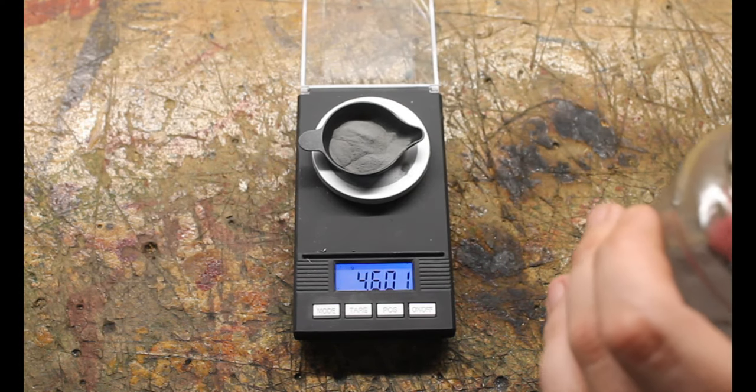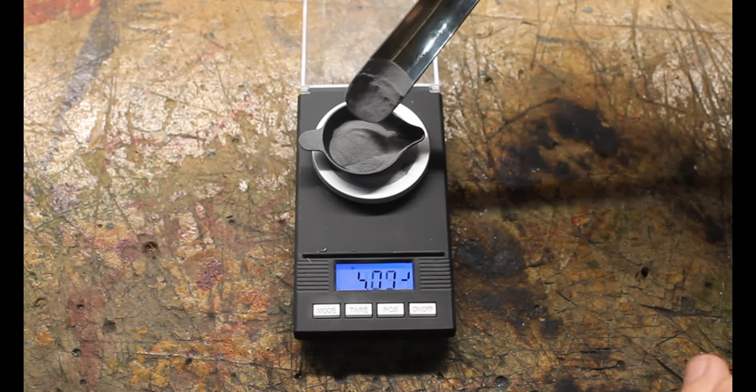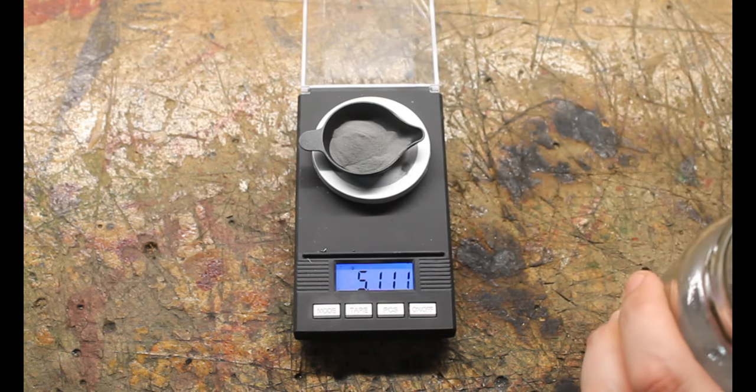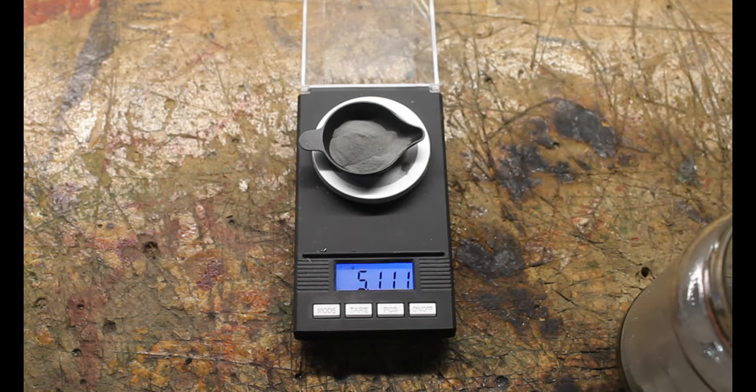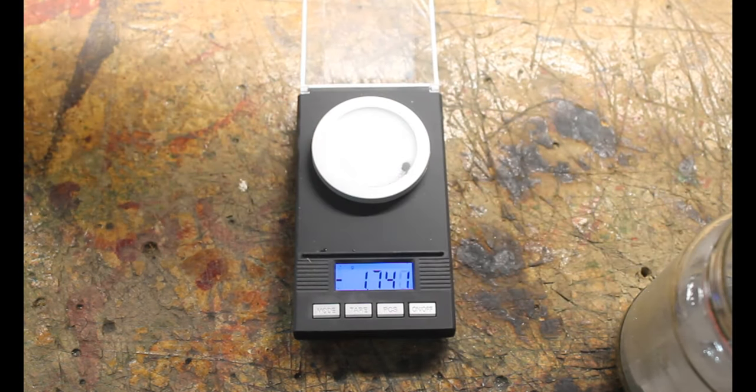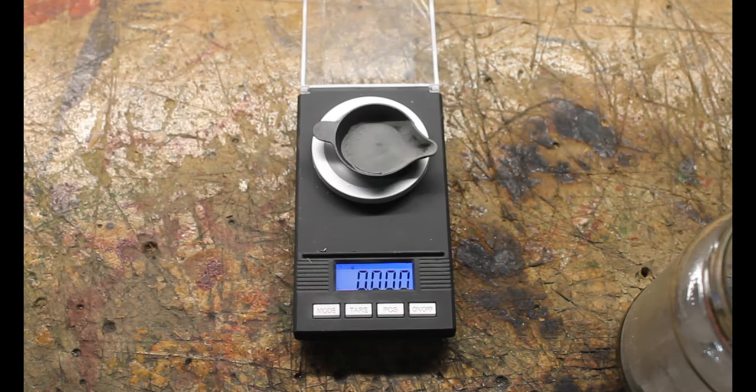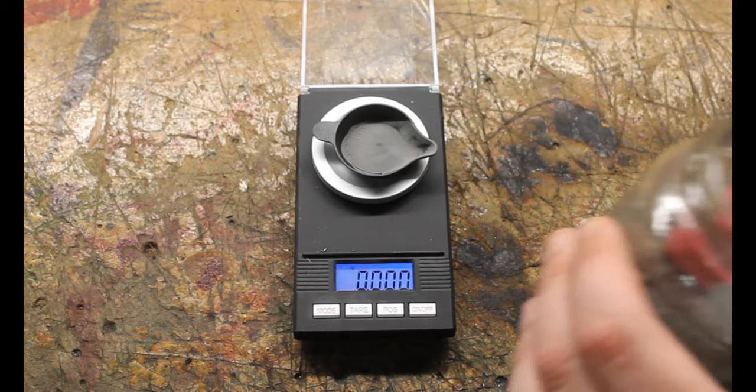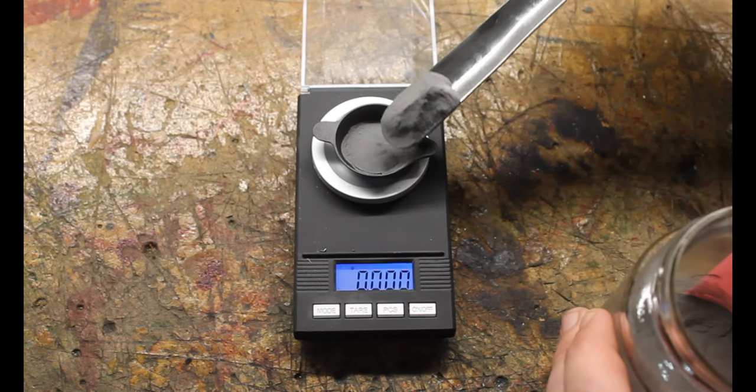We are going to start by measuring out approximately 10 grams of iron powder. Owing to the small size of our weigh boat, we do need to do this in two separate measurements of about 5 grams each.